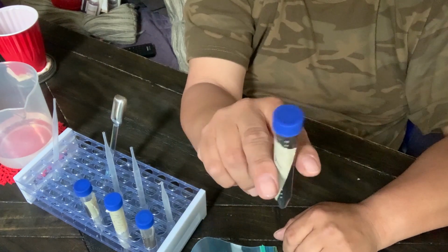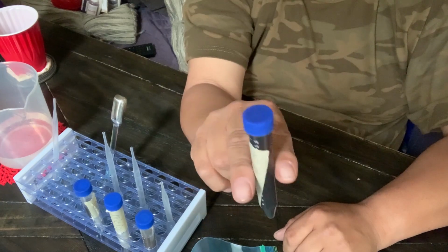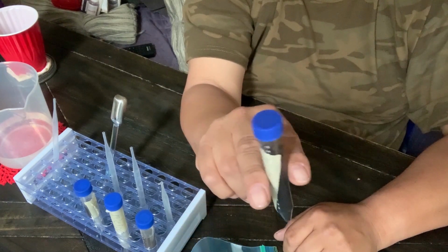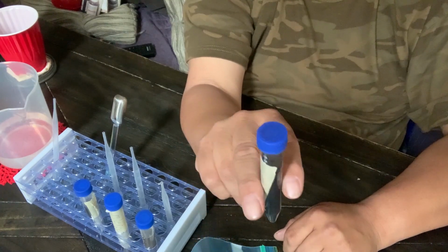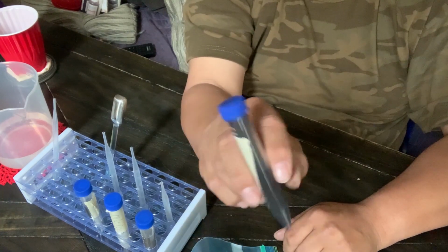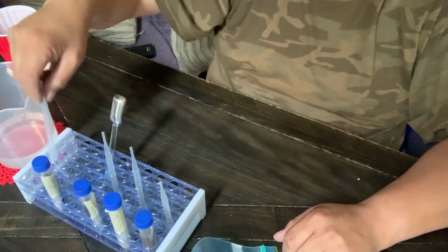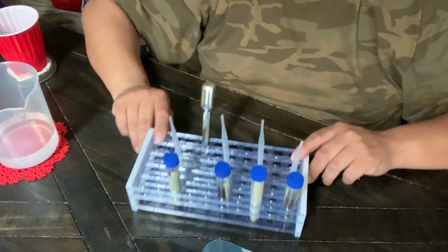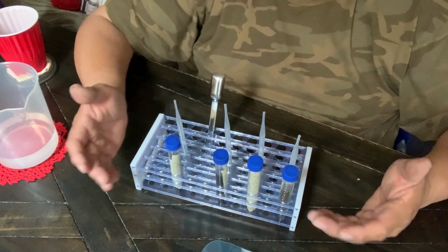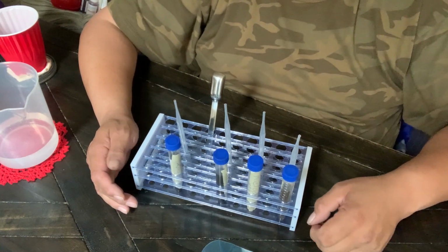All right. There we go. That should be done. Again, we're gonna have to do this again when we put it on the slide. But it's that easy. All right, and there you go. That's how we organize our test samples. All right, I'll see you under the microscope.